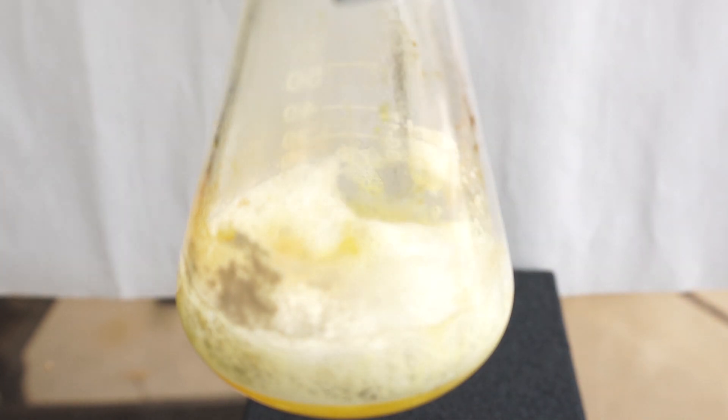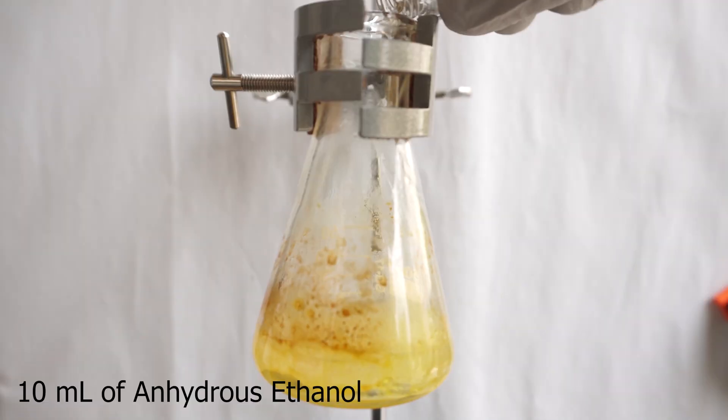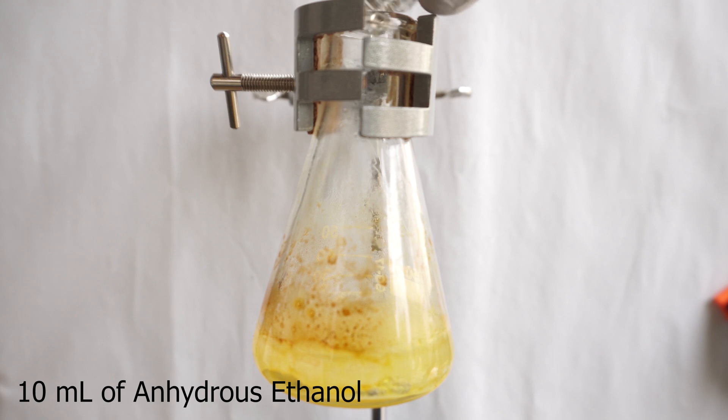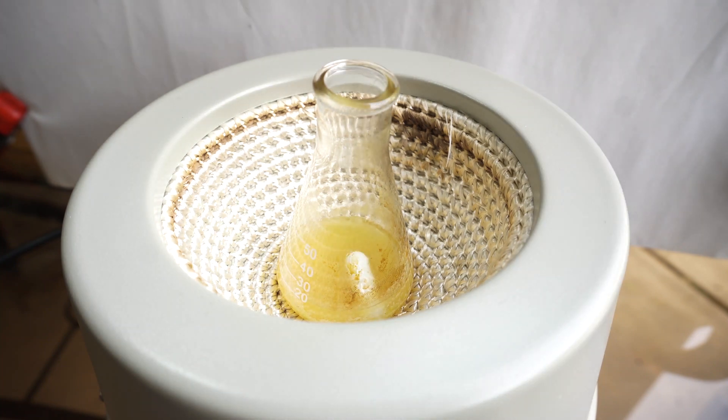Once almost all of the powder has reacted, we will let it cool down to 150 degrees before adding 10 milliliters of anhydrous ethanol. We will drop a stir bar in and let it mix for 20 minutes, followed by letting it sit for 15 minutes. The cadaverine is far more soluble in ethanol than the powder that is left. We could have also used water in this step if we wanted to dissolve everything.